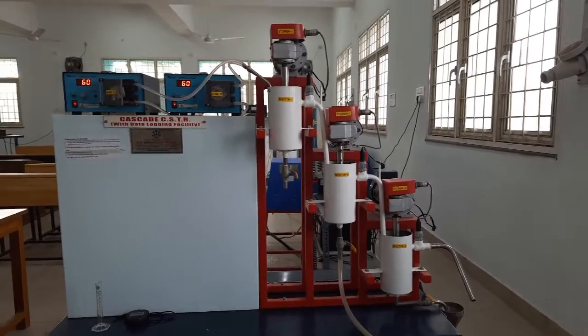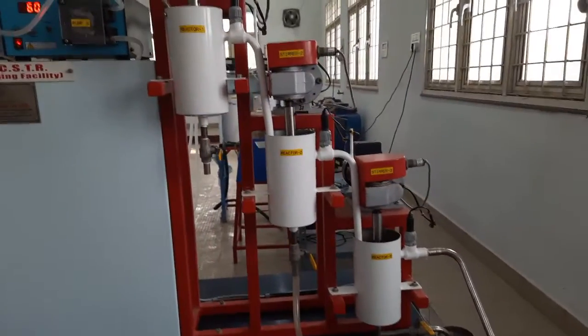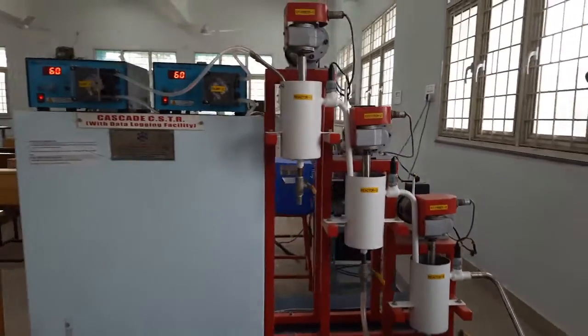Here what we are doing is we are trying to increase the conversion, because in the first reactor a certain percentage of conversion has taken place, and we are continuing the reaction in another reactor, where another residence time is there. Okay, so that way we are trying to increase the conversion.